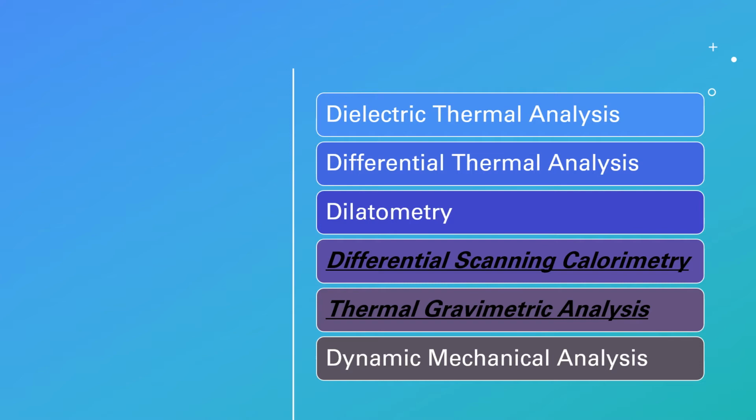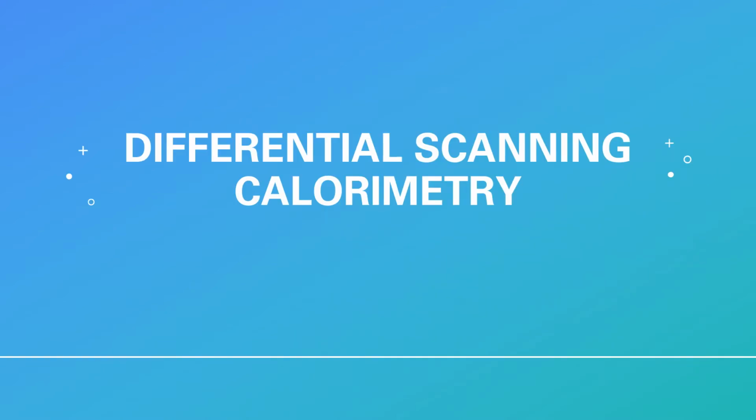The two techniques we are going to tackle are differential scanning calorimetry and thermogravimetric analysis, and lastly we have dynamic mechanical analysis. For the first technique, we have here differential scanning calorimetry.